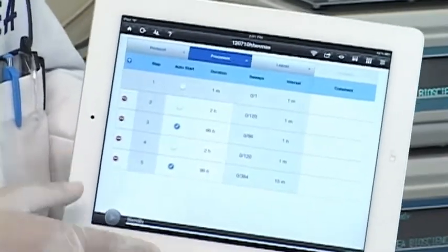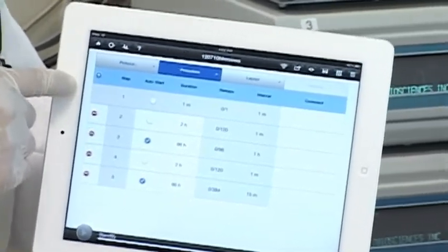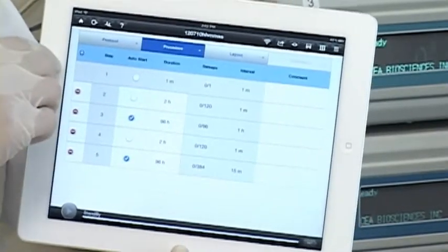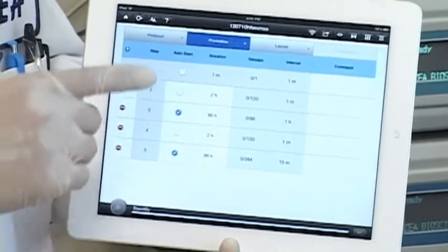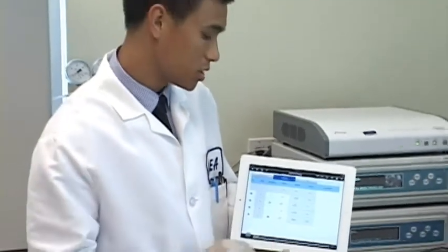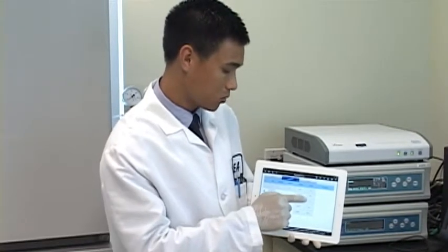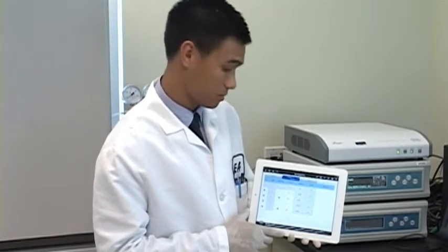Now from here, our setup is such that the procedure will measure the first time point, which is the background measurement, which is actually very important. It'll establish our baseline, which our subsequent cell index measurements will be compared to. And after that, an initial 2 hours at 1 minute intervals, which will measure the initial attachment and adhesion of our cells onto the plate, as well as 96 hours at 1 hour intervals, just to monitor the overnight proliferation.